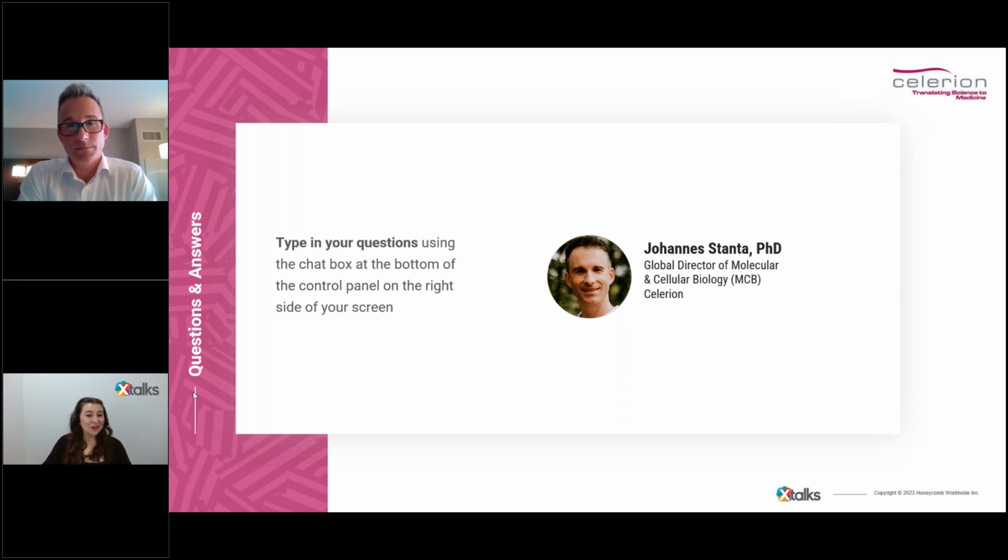Are short-term stability and long-term stability assessments performed during validation? Yes, very good question. And I haven't put that on the slides, but the answer is yes. It should be included as well, of course, to cover the duration of the storage. It's not too difficult to be done as well. Also, most samples will be analyzed fairly quickly, so you don't need to establish years and years of frozen stability. But it does need to be assessed, and usually a 3-month stability assessment, which is fairly quickly done, should really cover all the sample analysis that's needed for the duration.